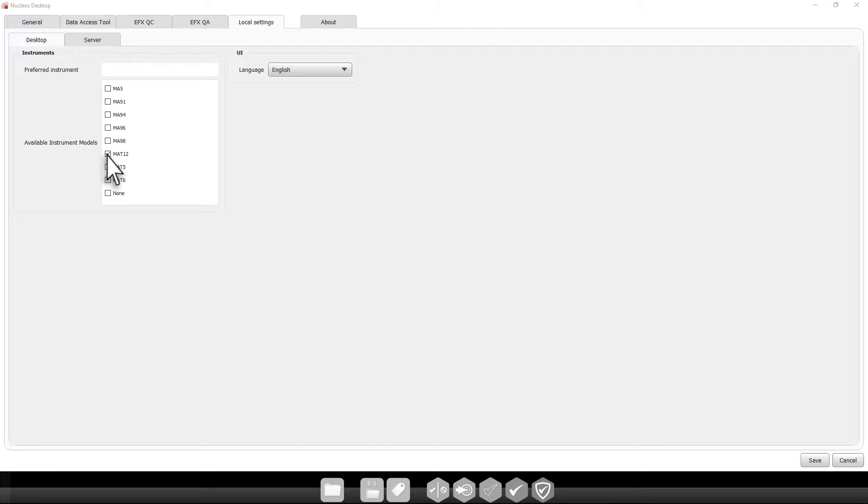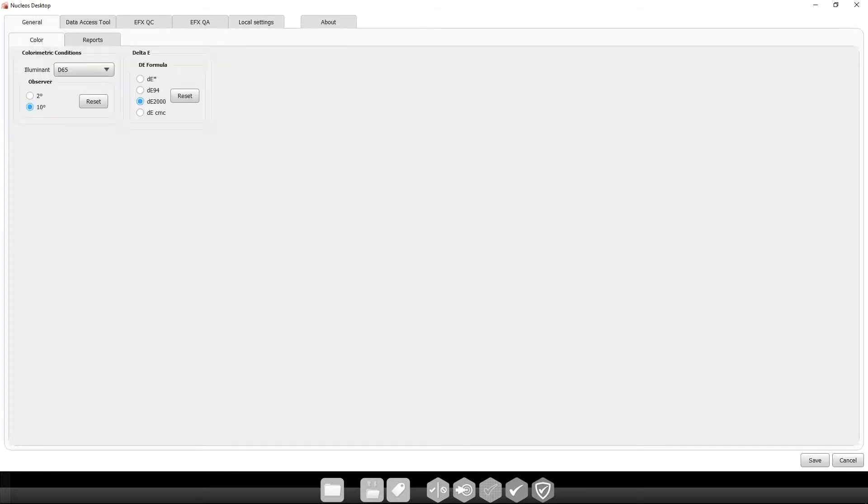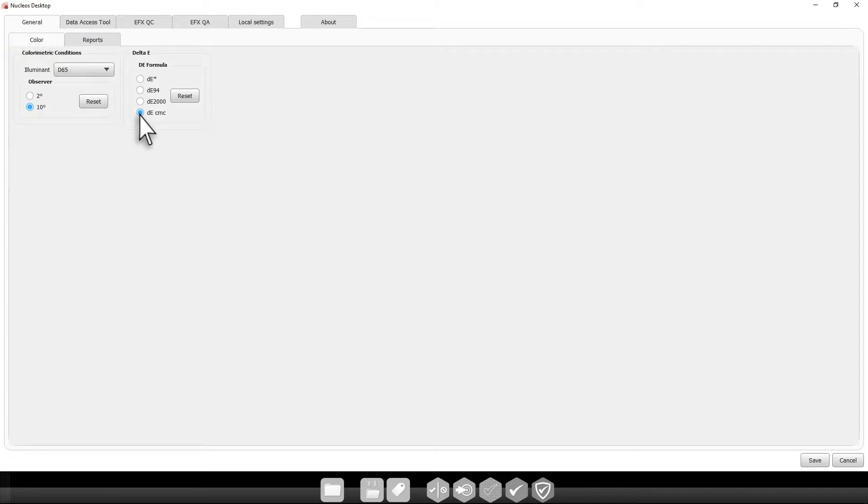Let's take a look at some other important settings. Under the General tab, you can select your color settings including Illuminant, Observer Angle, and your Delta E formula. We will change the formula to Delta E CMC.